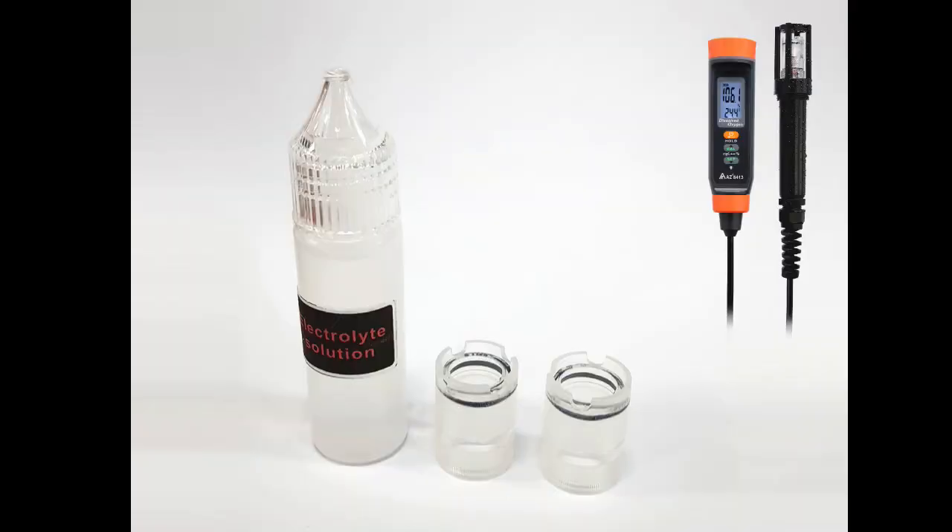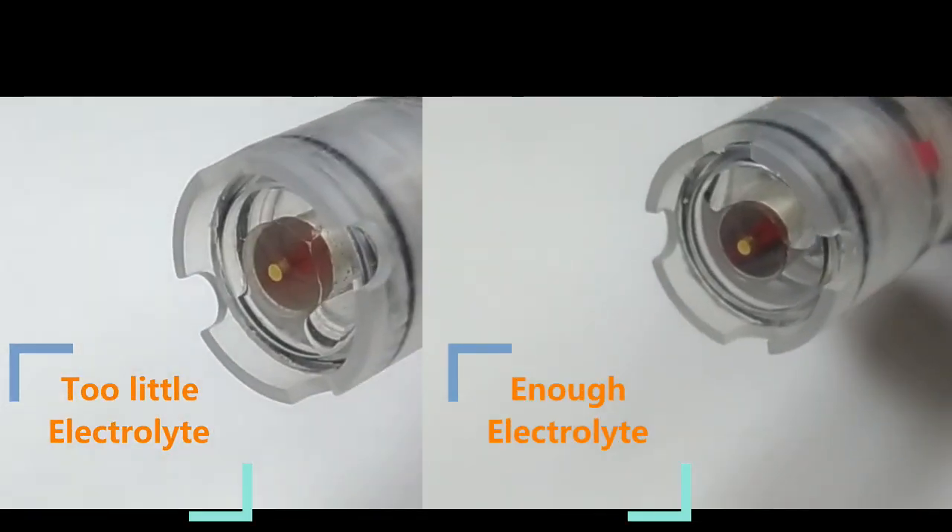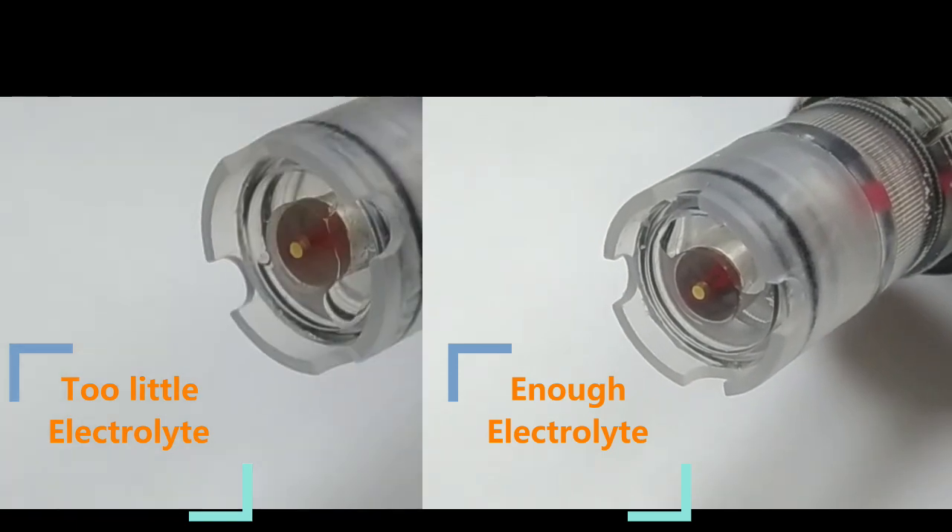After checking the test probe and seeing how the water is, maintenance after a period of use or half a year is also simple. Shake the test probe gently and visually check whether there is still electrolyte in the test rod.